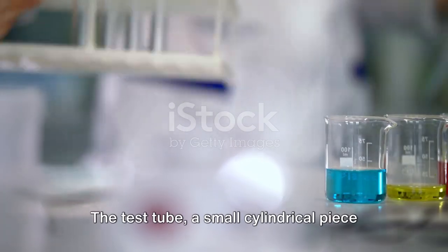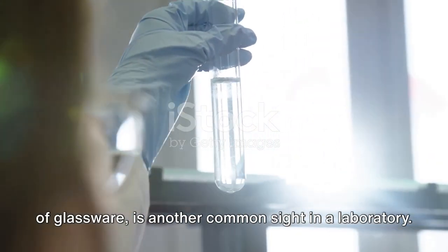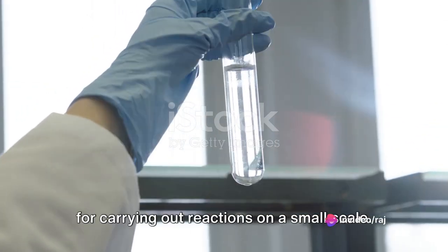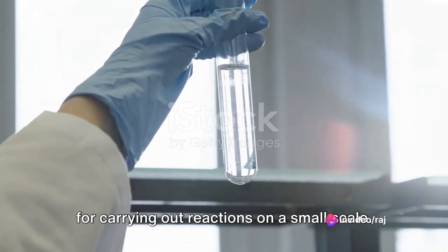The test tube, a small cylindrical piece of glassware, is another common sight in a laboratory. It's perfect for holding small samples or for carrying out reactions on a small scale.